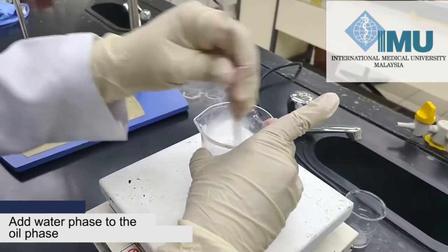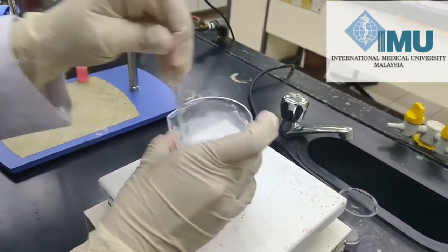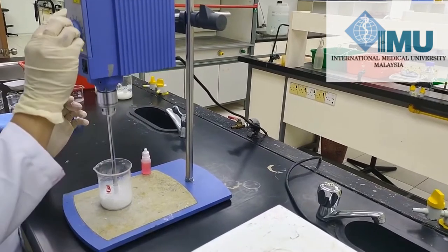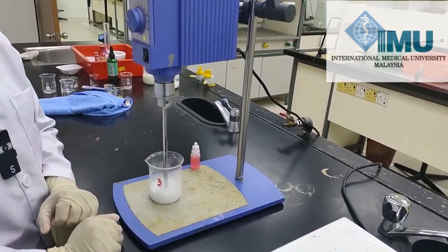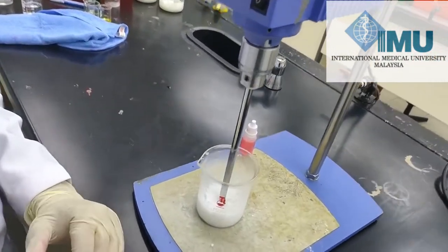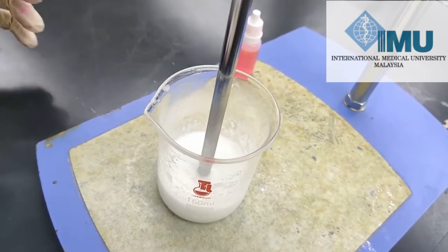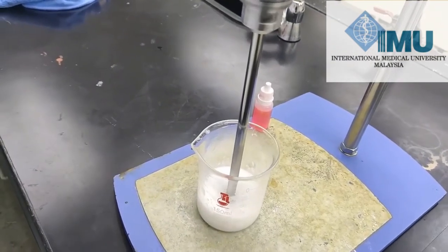Now we have mixed all the ingredients together. To make a smooth structure we will stir it using a stirrer for a few minutes. Shampoo is not as thick as conditioner — it will be a little more flowy compared to conditioner.